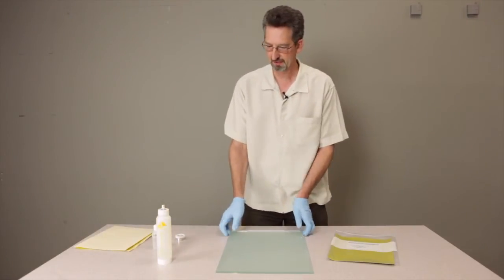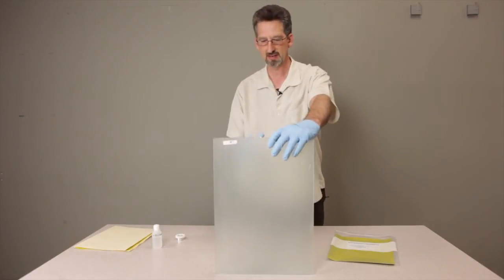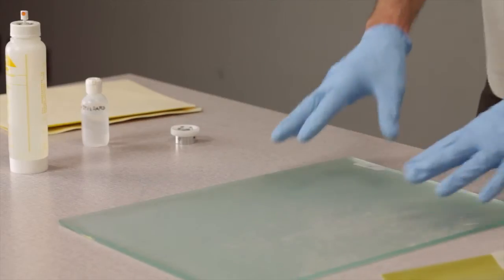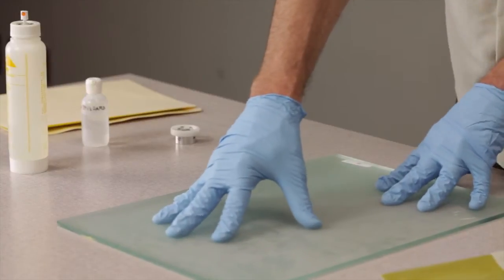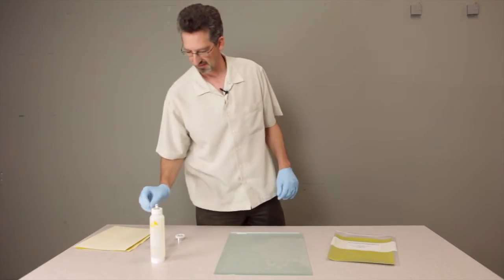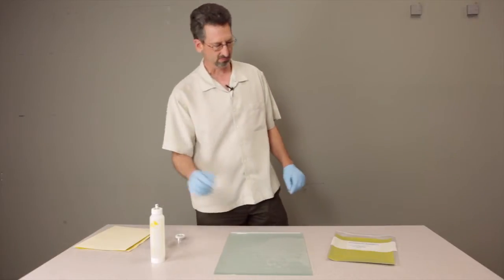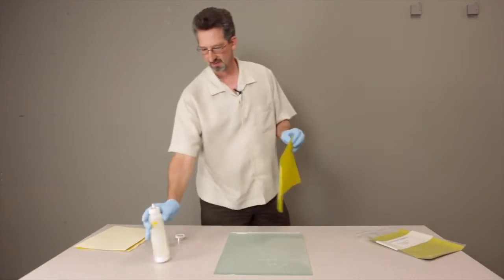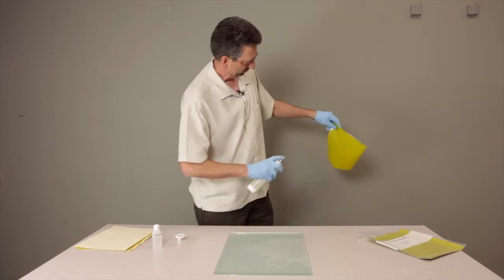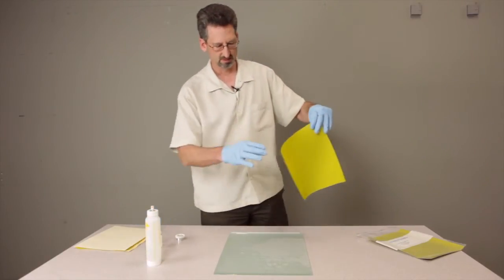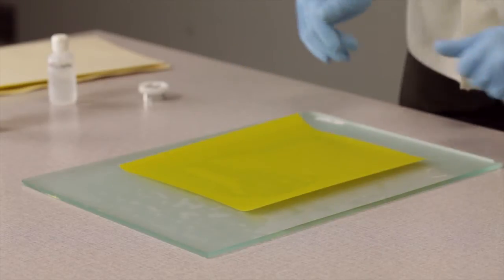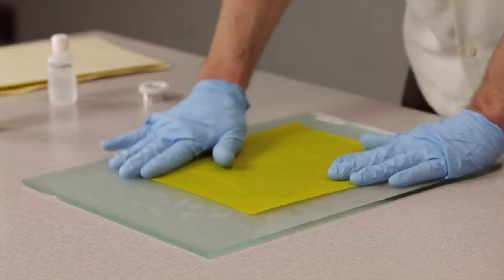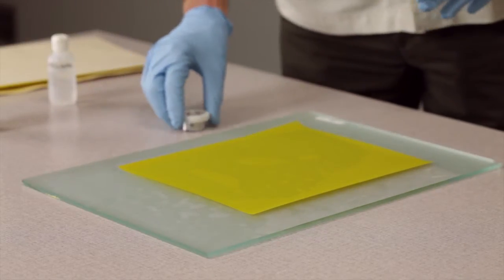So first step is we use a little bit of water on the backside of the glass and just spritz a little bit on there. And the plate will find a nice tight position there. We'll do the same thing on the back of the aluminum oxide sheet. Just a quick spray on the back. Since the water is only on the backside, it won't affect our samples, which often paints and varnishes are often water sensitive.